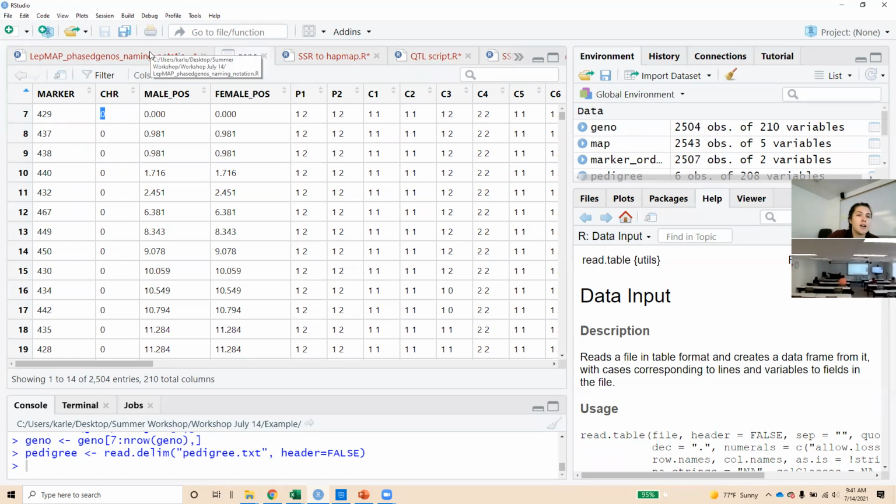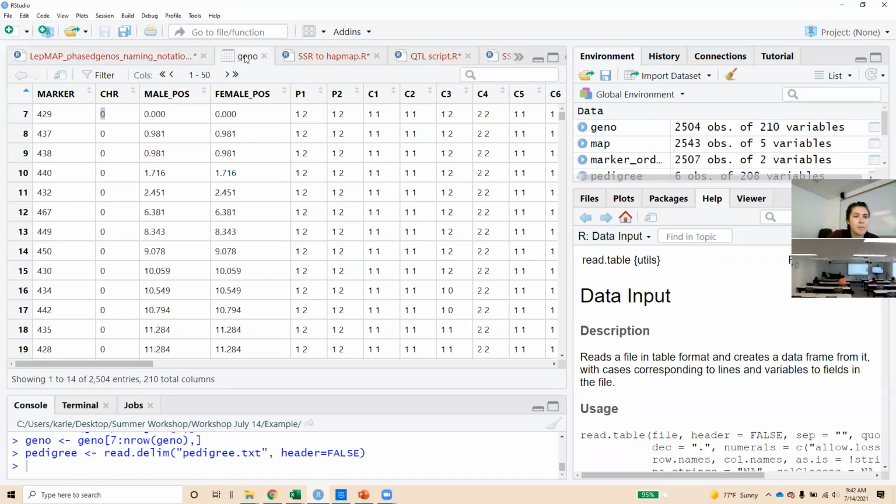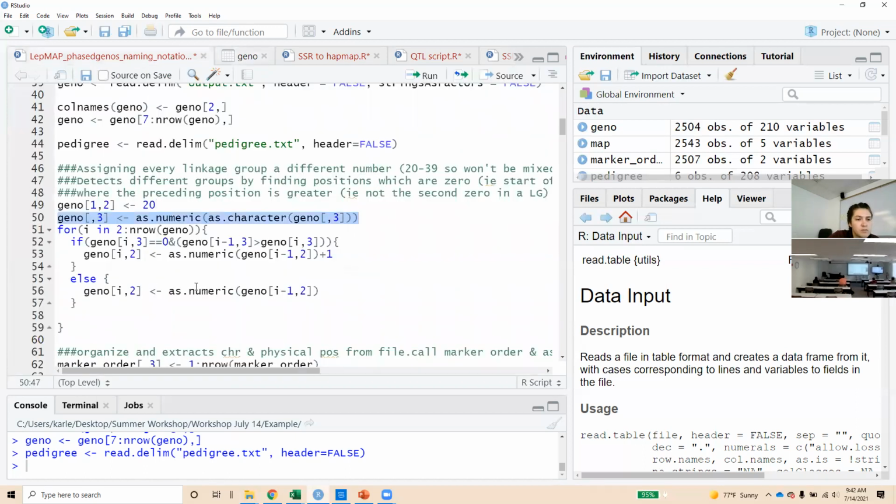To describe what this actually does, it makes sure that column 3 is stored as a number rather than as text. So you start at 20, and this increases the number, right? Yep.